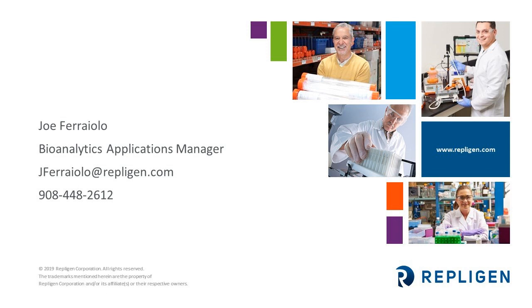Okay. What do you think is holding back the adoption of flow VPE from solo VPE? Sure. Much like the solo early on in its process, no one wants to be first to implement a perceived new technology.